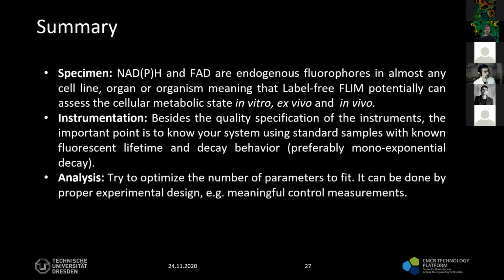So, in summary, we have talked about the specimens. NADPH or NADH and FAD are endogenous fluorophores in almost many cell lines, organs, and organisms. I'm not sure if it's in all, so that's why I mentioned almost. Meaning that in principle, label-free FLIM potentially can assess the cellular metabolism state in vitro, ex vivo, and in vivo.